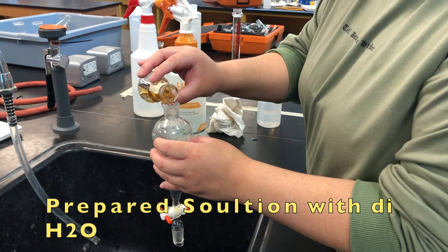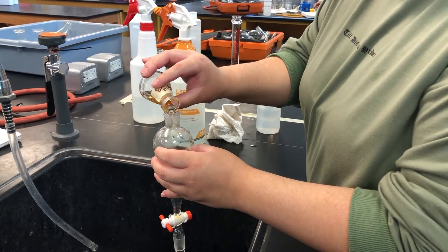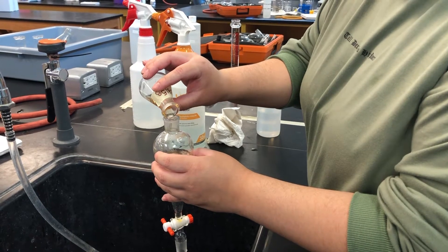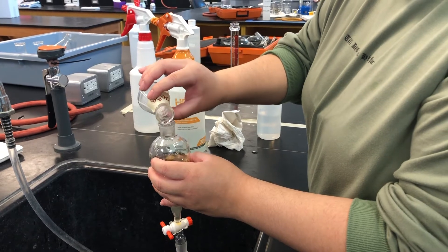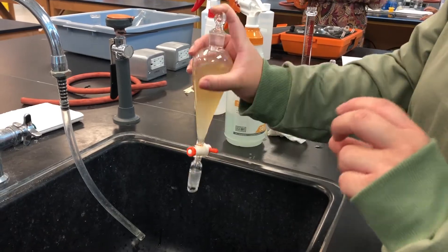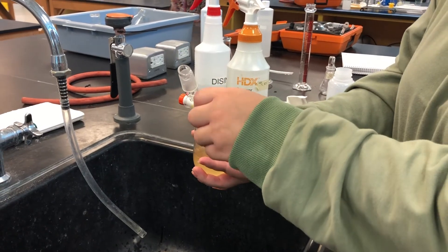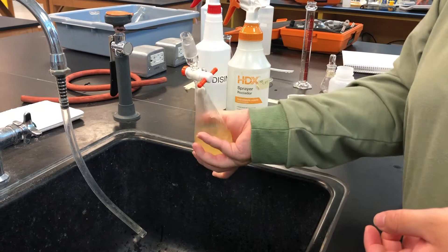Then, in a separatory funnel, add 50 milliliters of distilled water with the prepared solution given by your instructor. After, put the stopper on, mix and vent multiple times, and wait a few minutes for the solution to settle.